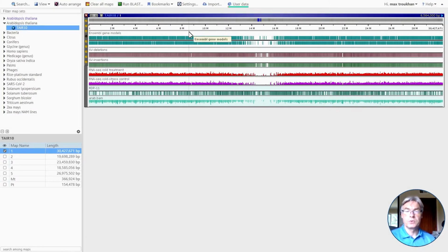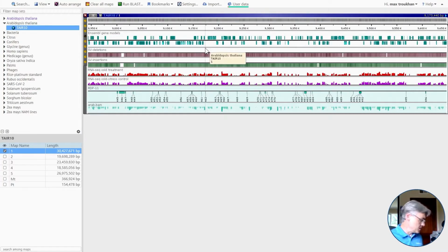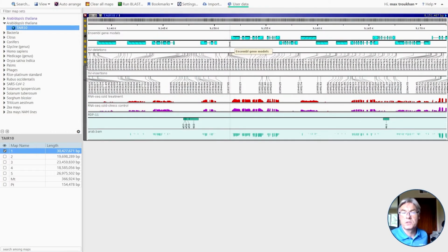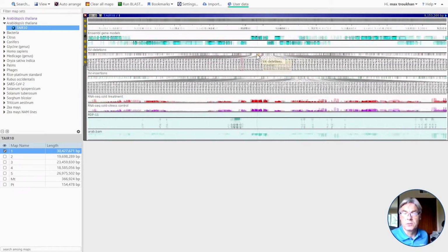If you want to see more details, you see this is the entire chromosome, and you can zoom in by just rolling the mouse wheel. Or with shift, you select the region and it will zoom in, and what's important, it's smooth. The animation is smooth, so you will never lose your focus, unlike other genome browsers.